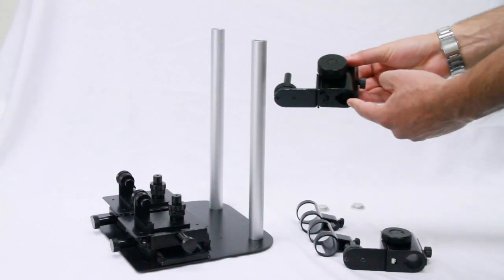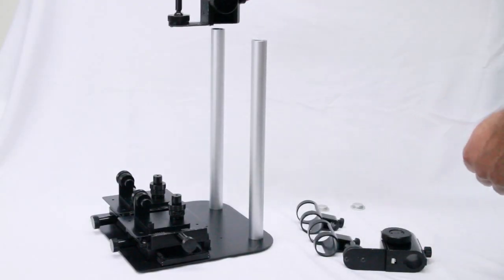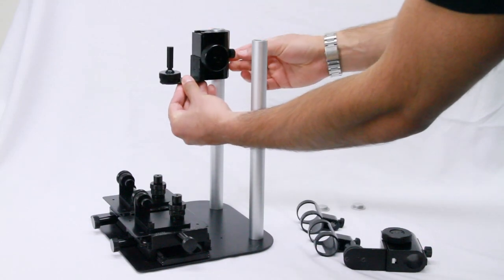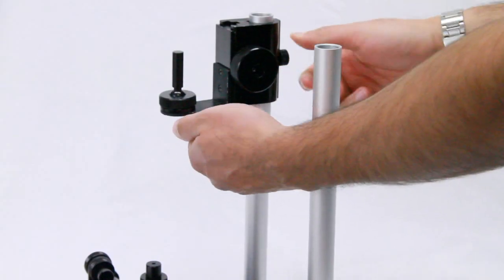Next, place the fine adjustment blocks onto each pole with the pegs facing up. Tighten the rear set screw to secure the desired height.